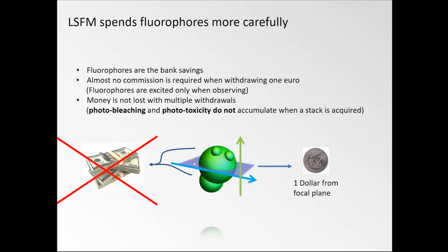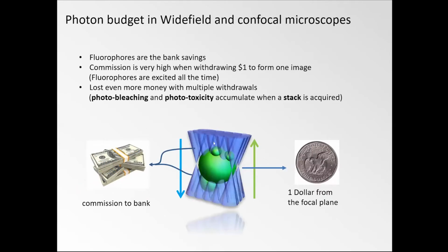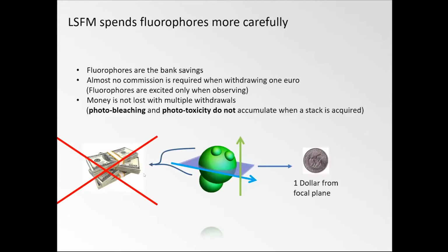All right. So sorry for the very basic, but for most people it becomes much more clear when we talk about money. So sorry if I assume that. Maybe that's just the thing in the US, but nevertheless, when you say 90% of the fluorescence you excite in a sample in a confocal is not used, sometimes it doesn't drive home the point as much as if it's the money in your bank account that just goes away. Well, all right, enough of that.